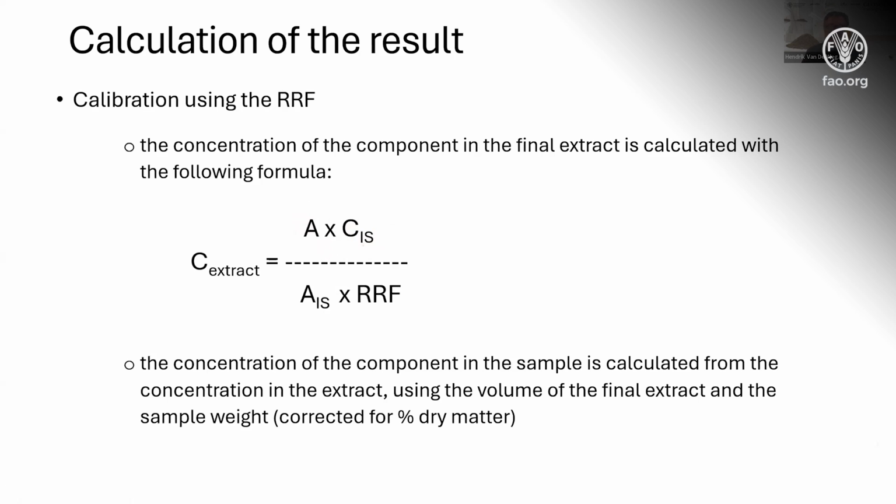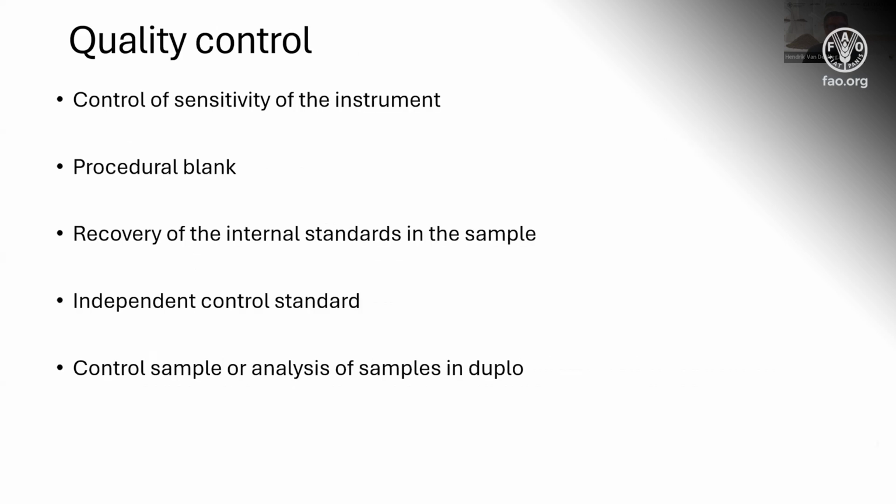These are also calculations that can be done automatically in most of the software. So I will not go further in detail here, because most of the times this is automated. I don't know if there are questions about the calculations and the calibrations before we go to the quality control.